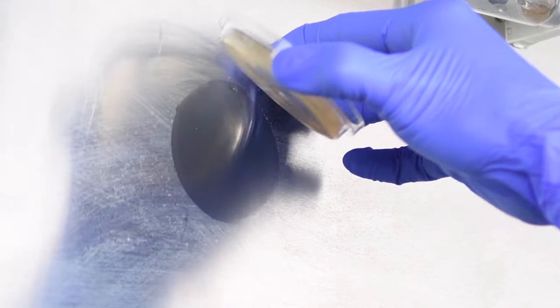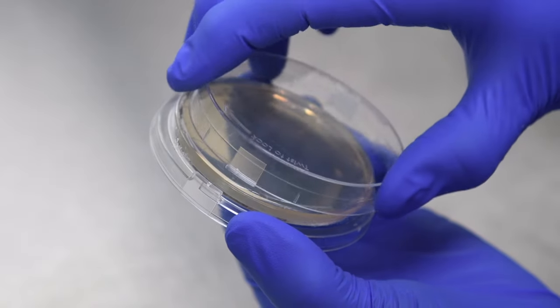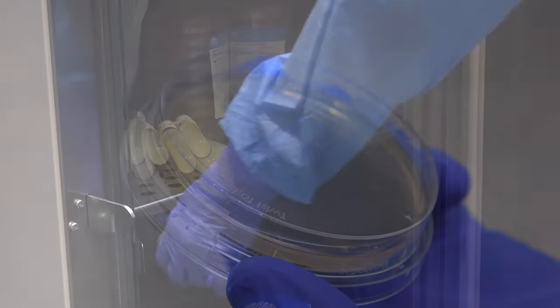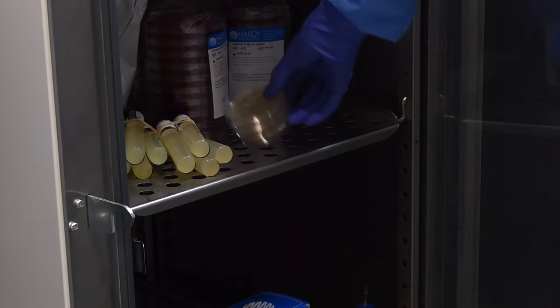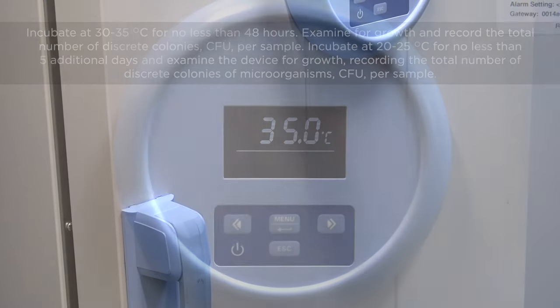The media plate will leave a residue on the sampling site, which should be removed after sampling using a sterile 70% IPA. Cover each sampling device and lock the lid into place to ensure the lid stays secure. Store the media inverted during incubation to prevent condensation from dropping onto the agar.